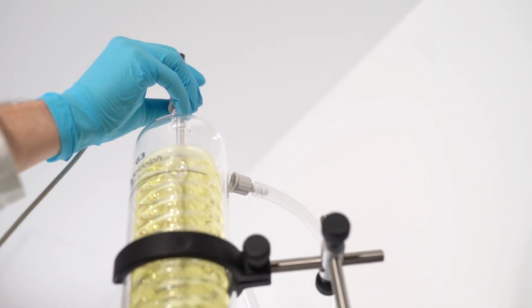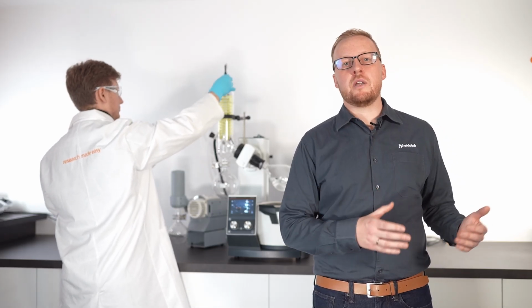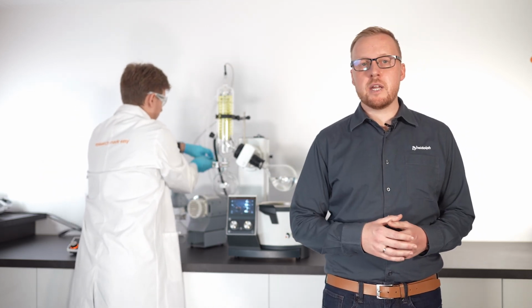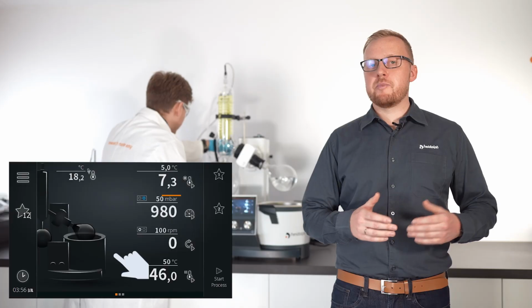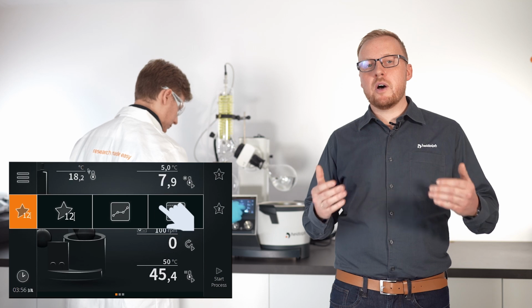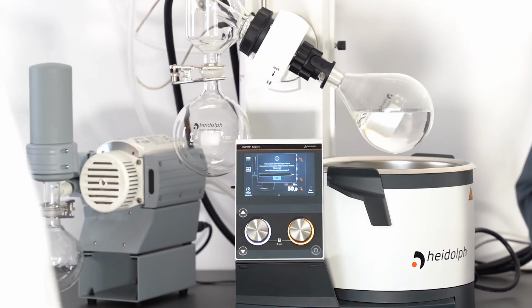You can connect the AUTOaccurate sensor, which is an optional accessory, to your HiVap Expert or Ultimate control unit. The system will recognize the sensor automatically and will allow you to start the so-called Dynamic AUTOaccurate evaporation. The first and most important change on the display is that you won't see the set vacuum anymore, as the program automatically searches for the right vacuum level, so you do not need to know the right parameter. The system will do the job for you.